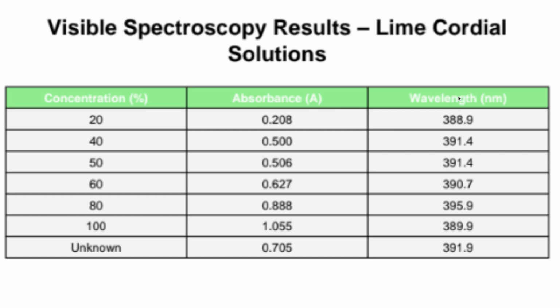Now you can see the wavelengths here, they vary, but the general pattern is that it goes up until we reach 60%, and then it goes down slightly, then it carries on going up, and the 100% one again goes down. So we were a bit worried about the 60 and 100% concentrations, but otherwise I think this part of the practical also went quite solid. Again, errors which I wrote down in slides to come, that there definitely were some errors on our part. 100% success rate is never assured.